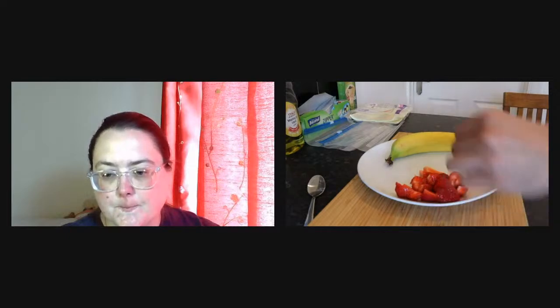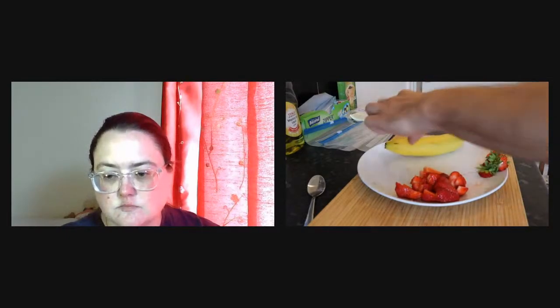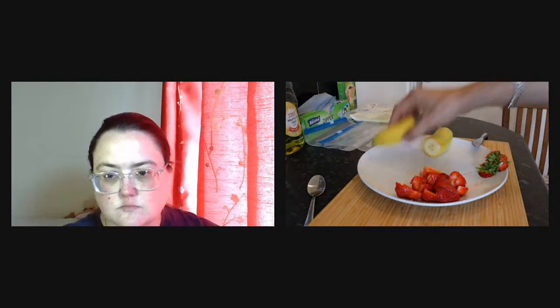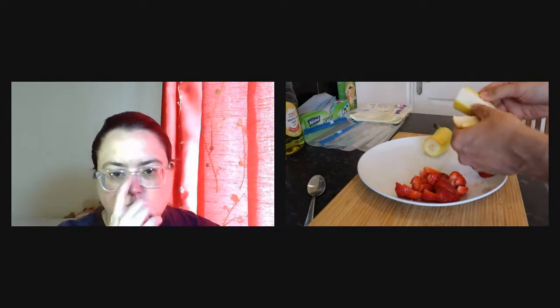I also have a banana, and I'm going to just cut it in half. And I will take 1/2 of the banana, and I will remove the skin.